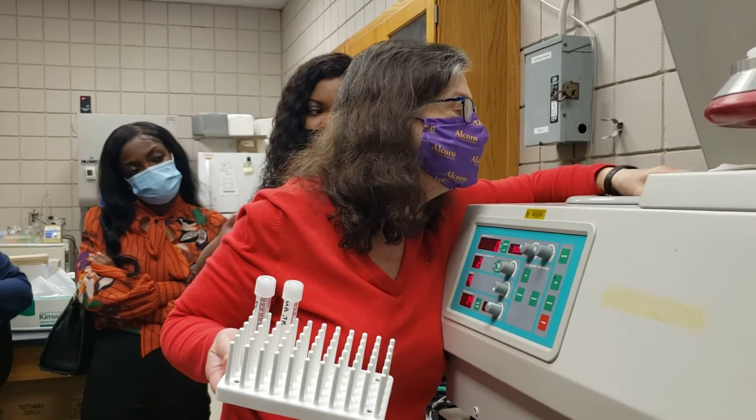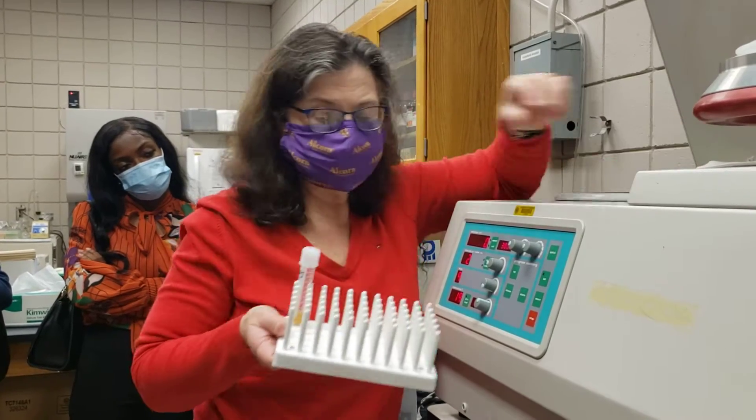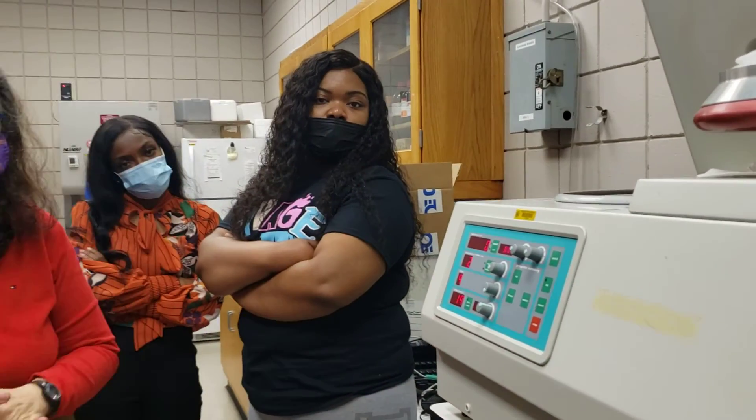Hopefully it's balanced, because I'm unbalanced. Okay, do you want to take a picture of the rotor with the tubes?